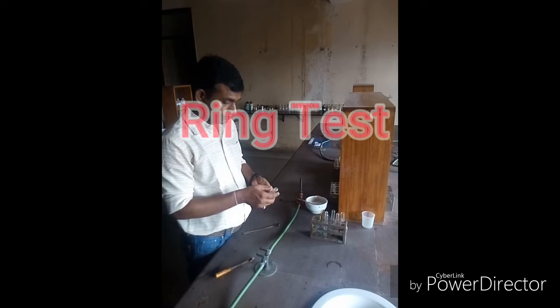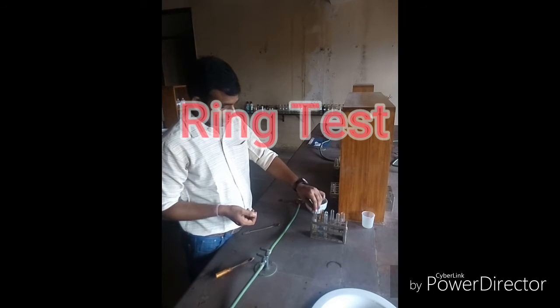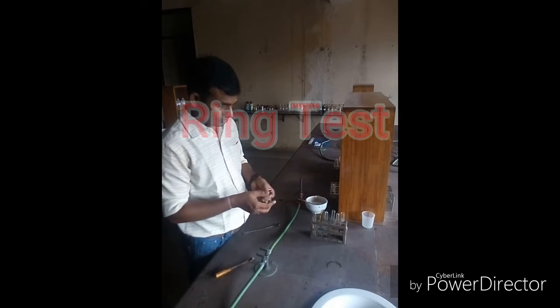Hello friends, today we are going to perform the ring test. To perform the ring test, first take a clean and dry test tube.